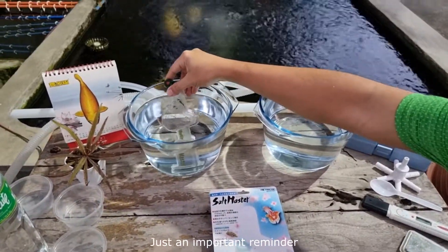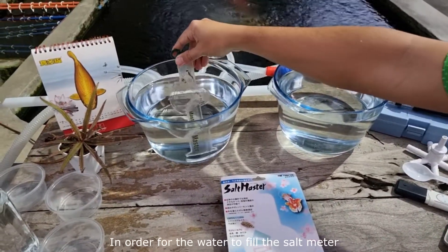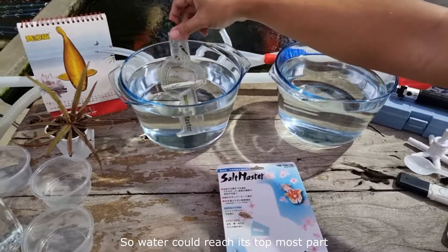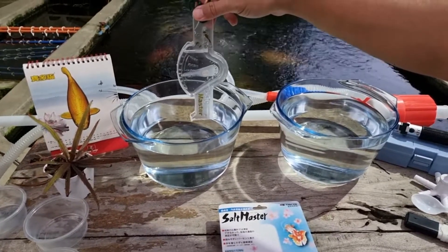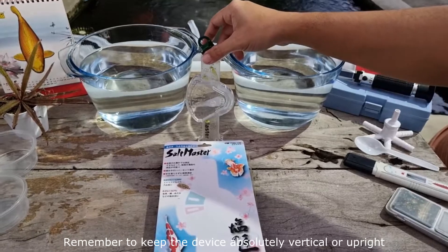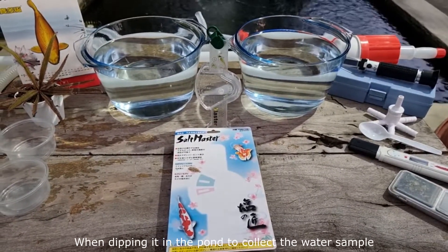Just an important reminder: in this demonstration, in order for the water to fill the salt meter, I had to slightly bend the device at an angle so water could reach its topmost part where the water spillway is located. When it is your turn, remember to keep the device absolutely vertical or upright when dipping it in the pond to collect the water sample.